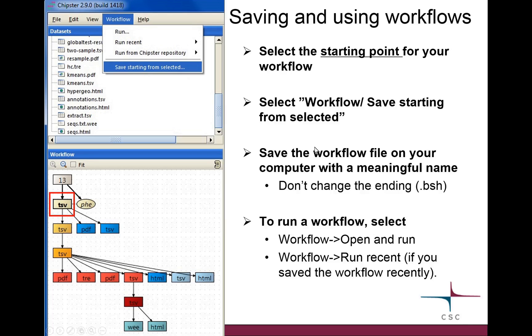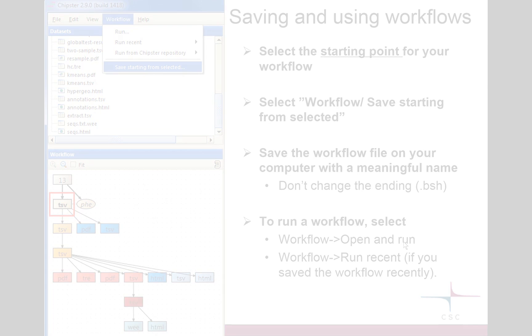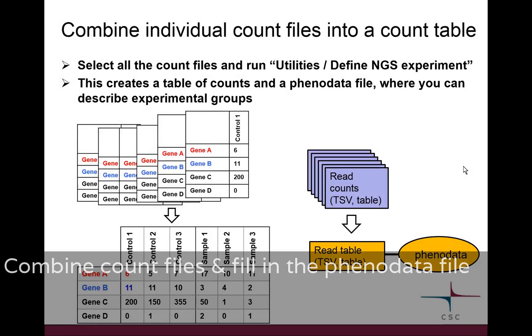Then when you come to run it, you have actually two options. Today I showed you this run recent option because we are now saving the workflow as we work. But if you get a workflow file from someone else, you would copy the file somewhere on your computer, and then you go to this run option and it allows you to navigate to that file. So it's quite simple really. In our case now we had two samples. You normally would have much more.